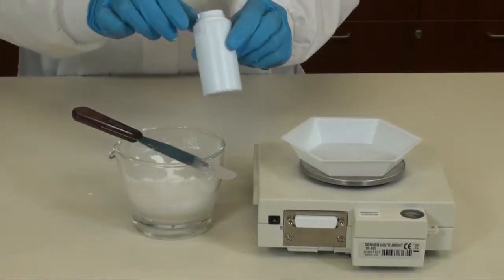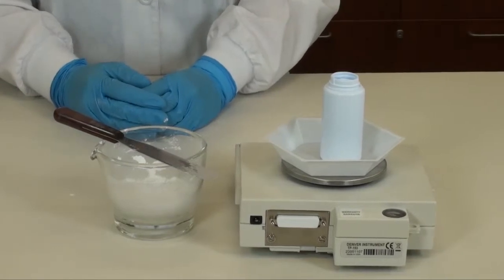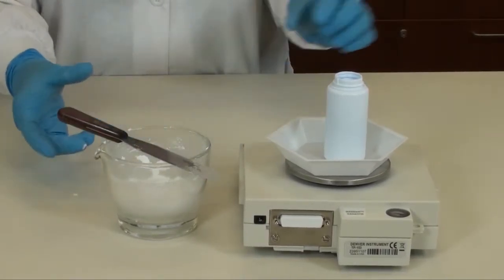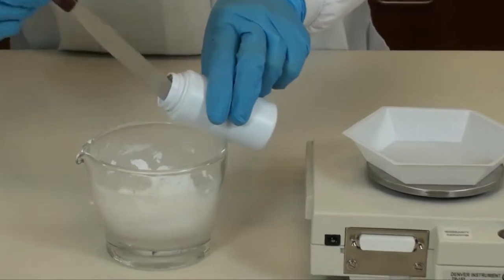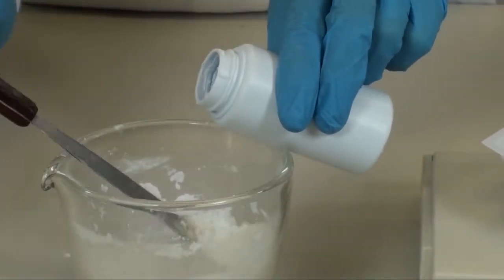Place your empty shaker bottle into a large weigh boat that's on the scale and tare the scale. Now go ahead and, holding the shaker bottle over your mortar, fill the powder to the prescribed amount.